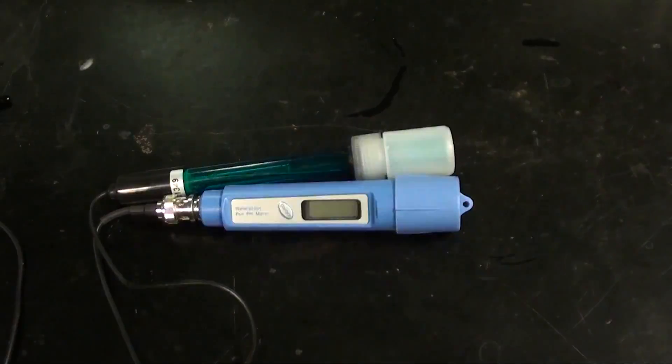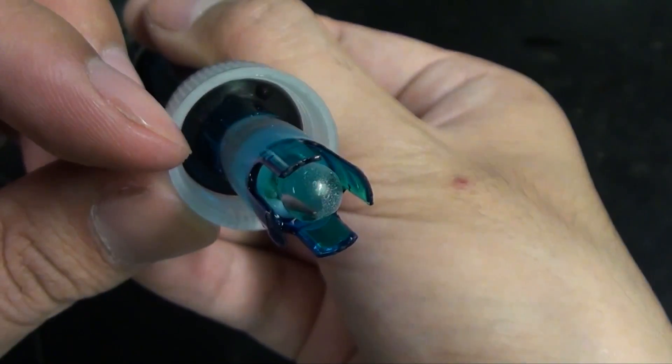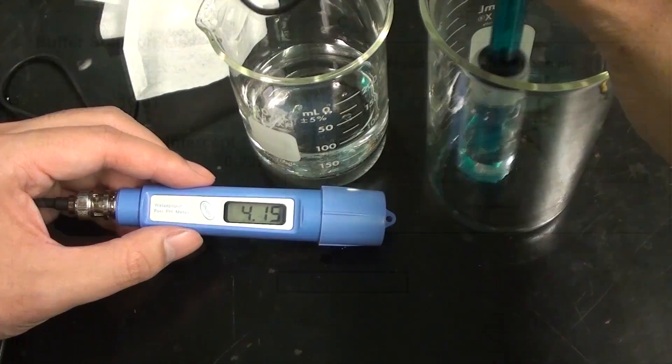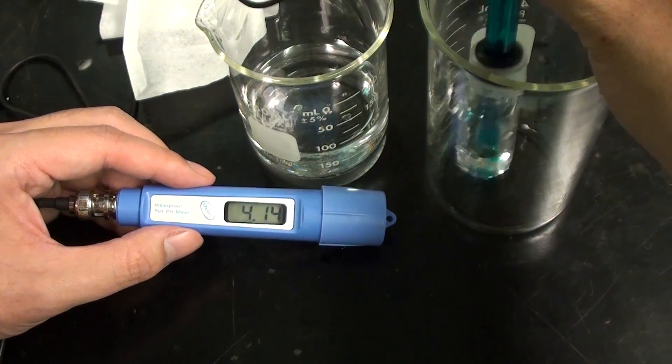Greetings fellow nerds. In a previous video I showed the pH meter and the basic approach of calibrating one. But cheaper meters had a problem that slope errors could not be corrected for.